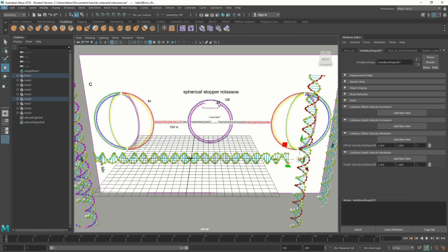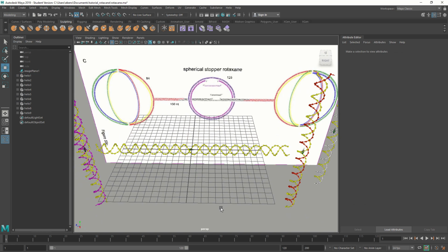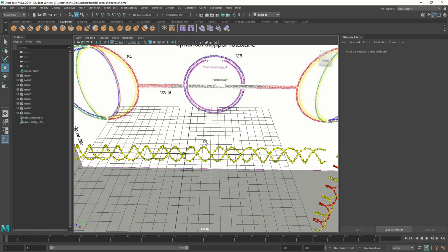And now we just need to take care of this Rotaxane ring. So, we wanted to thread around the slider here, and I can imagine a few ways of getting a nice ring that actually threads it. So one way would be to just create them separately, simulate them separately, and then merge the simulations in oxDNA, for example, and just put the ring on the thread. But here I'm going to try to create it all inside vHelix.